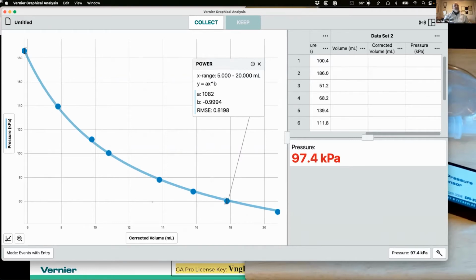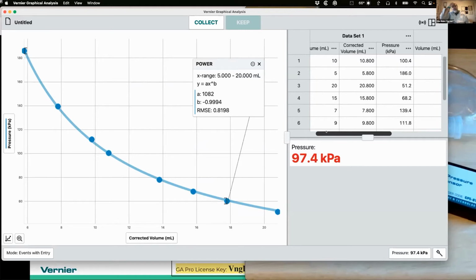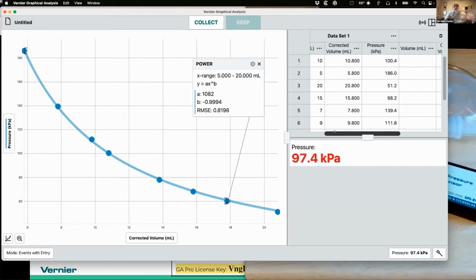That ain't bad, right? And so by doing that, could you do this with Excel? Of course. Could you do it with Sheets? Of course. Could you just go in there and type the numbers in? But I worked with a teacher last night on AP Chem Experiment 1, the sports drink lab, and all those manipulations in there. I showed her, you can do them all. You don't have to export to Excel unless you want to. But yeah, look at that. Very nice. So this is showing that pressure is inversely proportional.